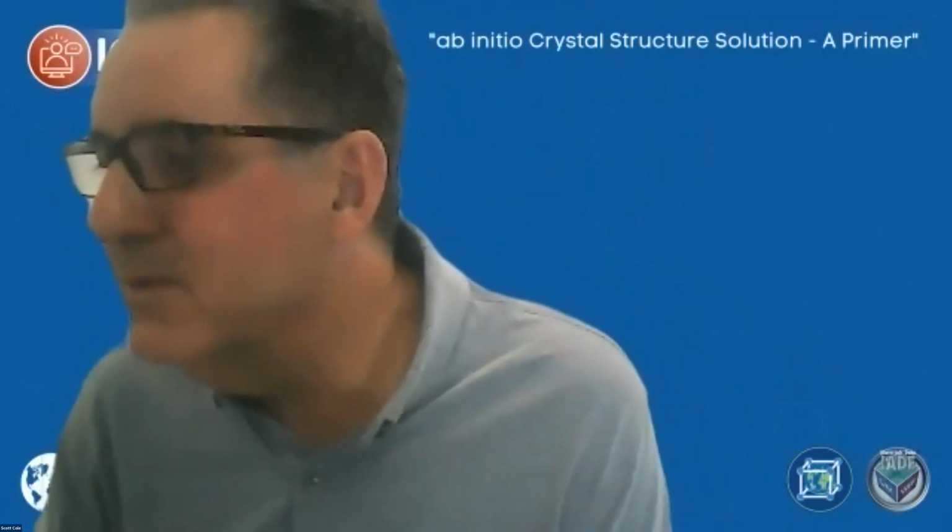There are some solid solutions and alloys for which the XRD patterns are not available in the database. Is it possible to submit the XRD data we obtained experimentally to the ICDD database? Okay. Again, the short answer is yes, but there can be an it depends. The ICDD is producing this database for phase ID. So if the patterns are different enough to be useful in phase ID, they'll certainly be interested in them. It'll depend on how different they are.